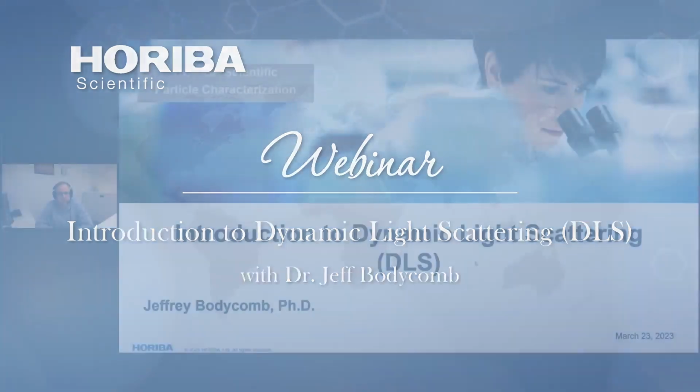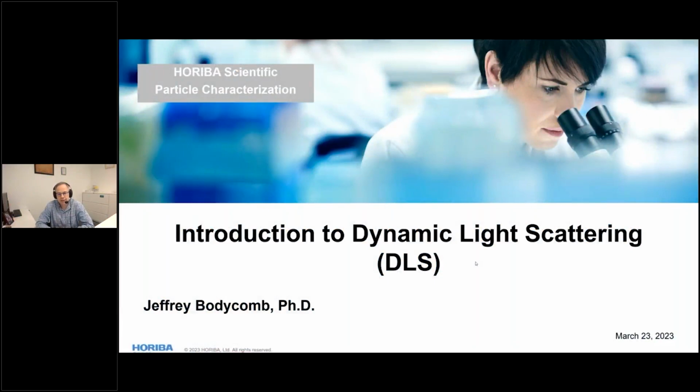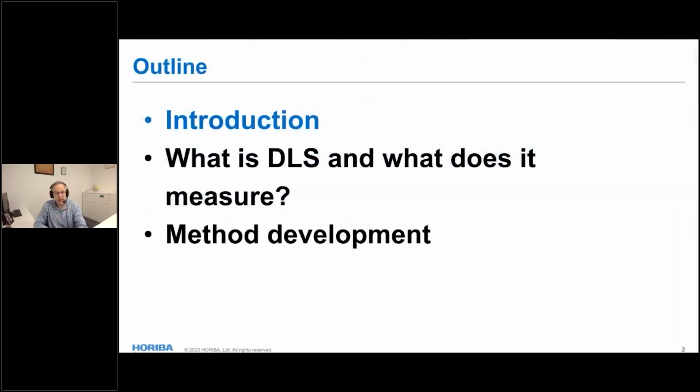Okay, great. So today's presentation is Introduction to Dynamic Light Scattering, and we're going to get ourselves started on a pretty popular nanoparticle characterization technique. I'm Jeff Bodycomb with HORIBA Scientific, and I'm coming to you from our office and factory in New Jersey. Quick outline: I'll give an introduction and some perspective, move into the meat of the topic, which is what is dynamic light scattering and what does it measure, and then I'll wrap up with some comments on method development and using the technique.